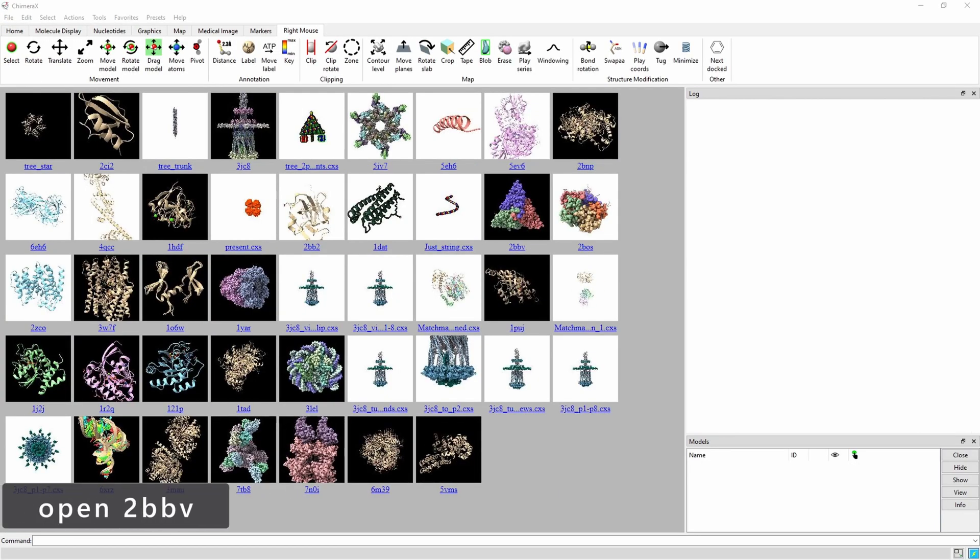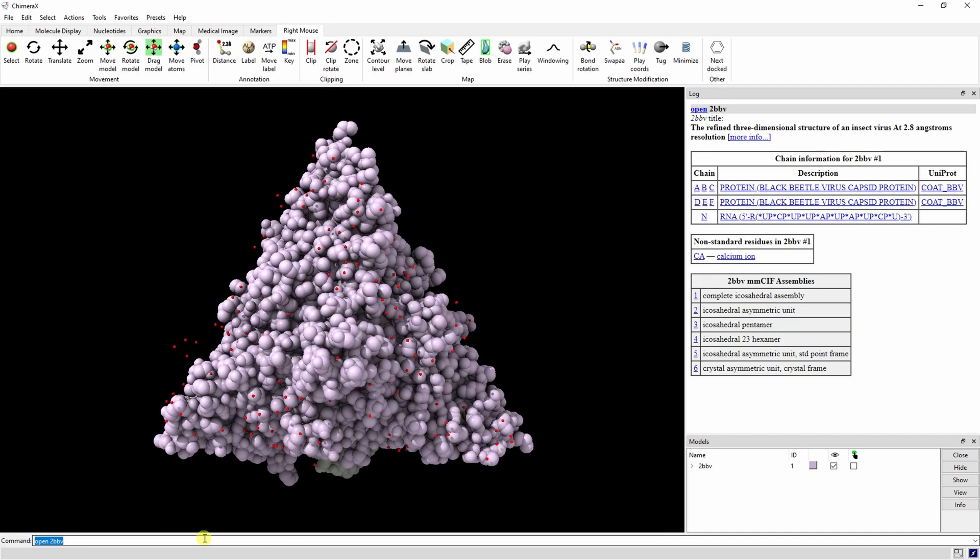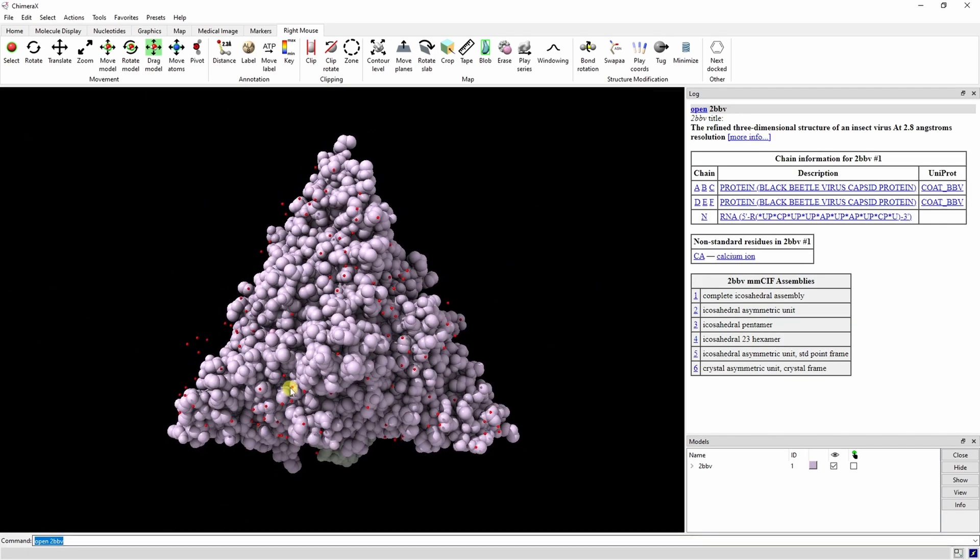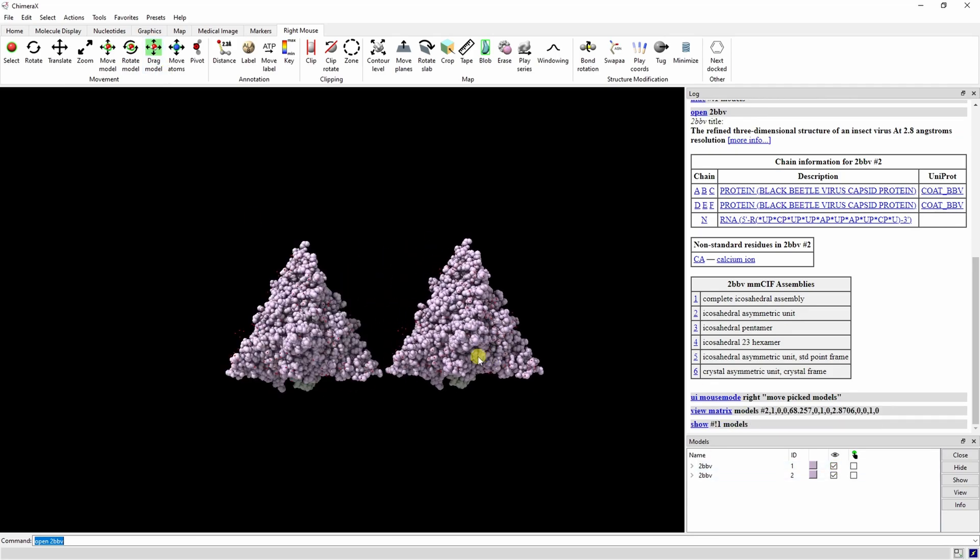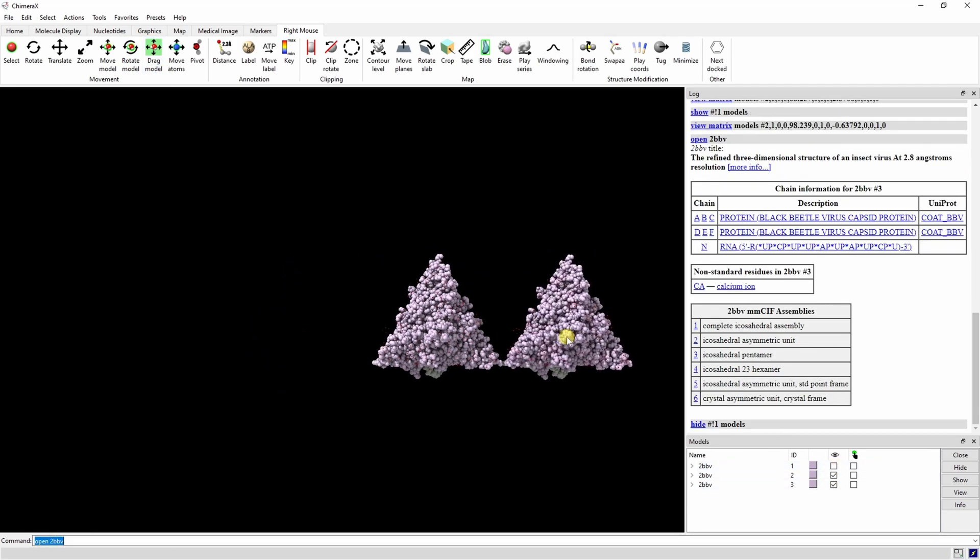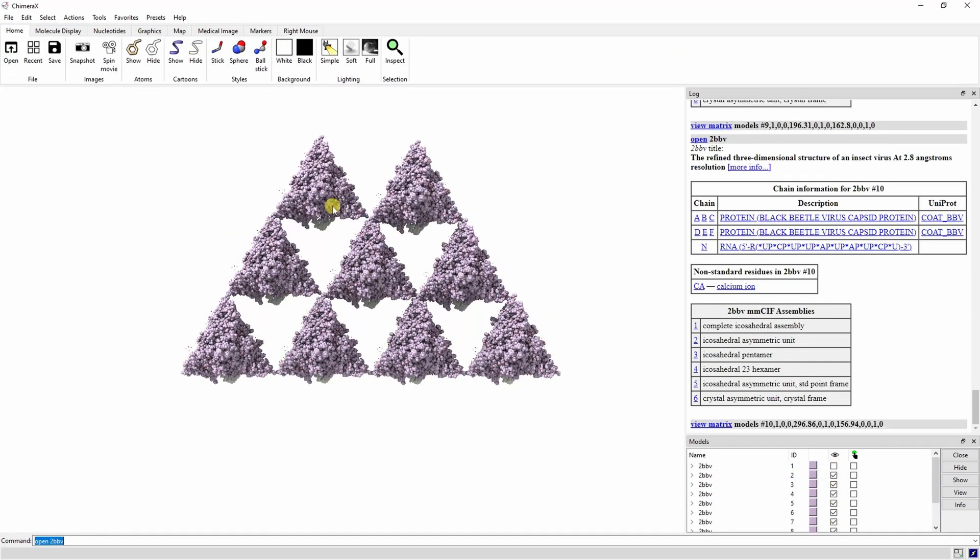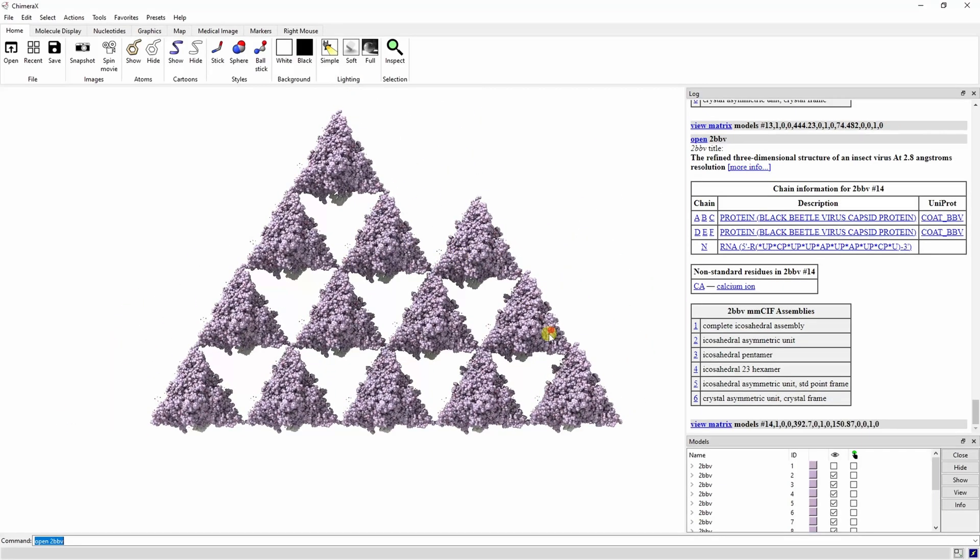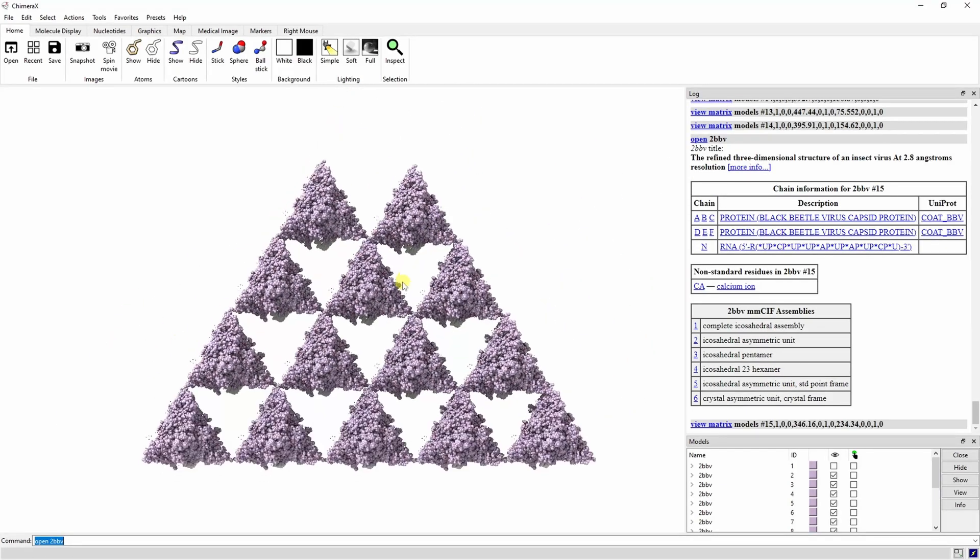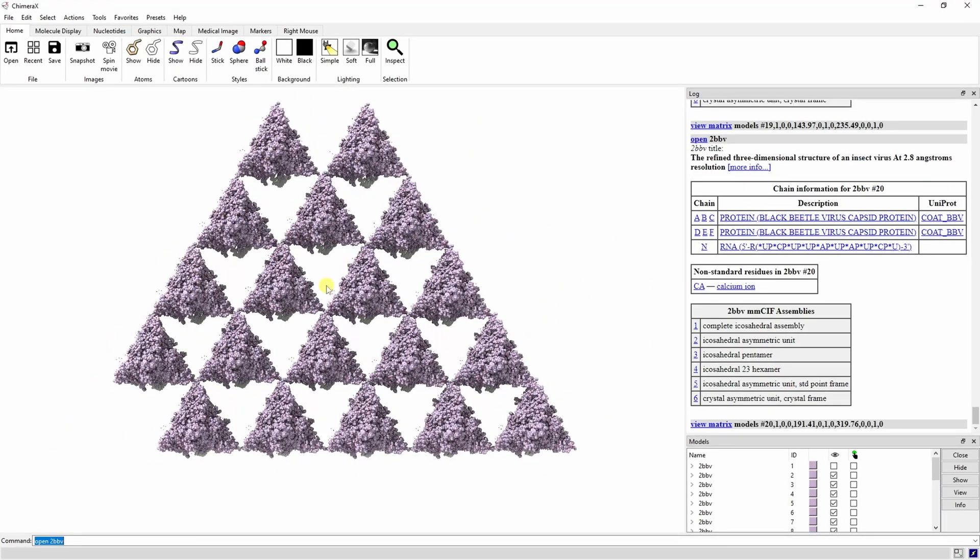Next, open 2BBV to make the branches of our tree. This is part of an insect virus. We're going to open up 49 of these proteins and stack them to make a larger triangle using the drag model option in the right mouse menu. The base of the triangle is going to be made up of seven proteins.